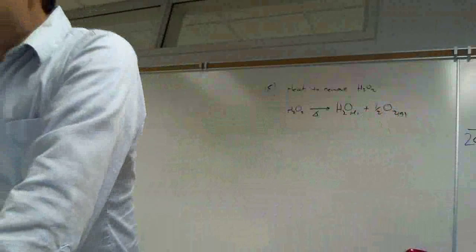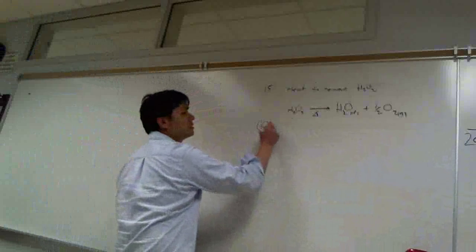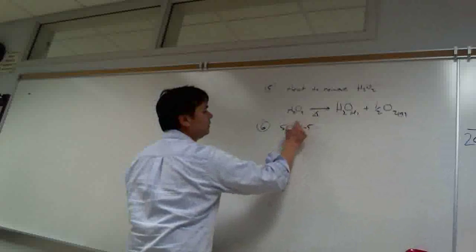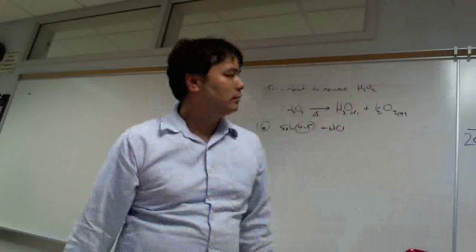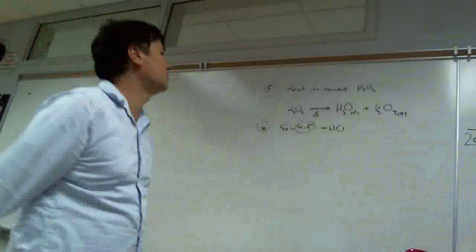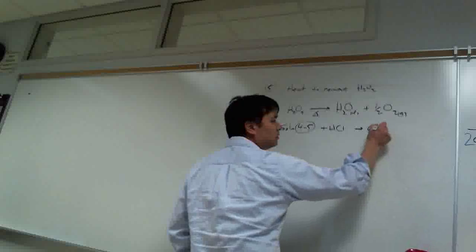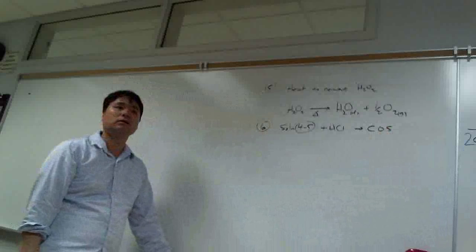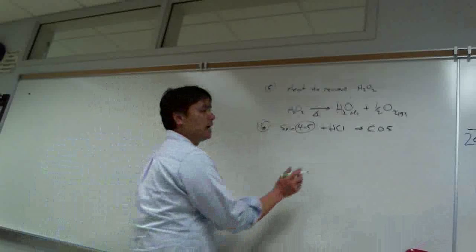And now we add HCl to the solution 4,5. Solution 4,5 plus HCl yields what? What happened to our chromate when we add HCl to this? It goes from a clear yellow solution to a clear orange solution. So how does that happen?